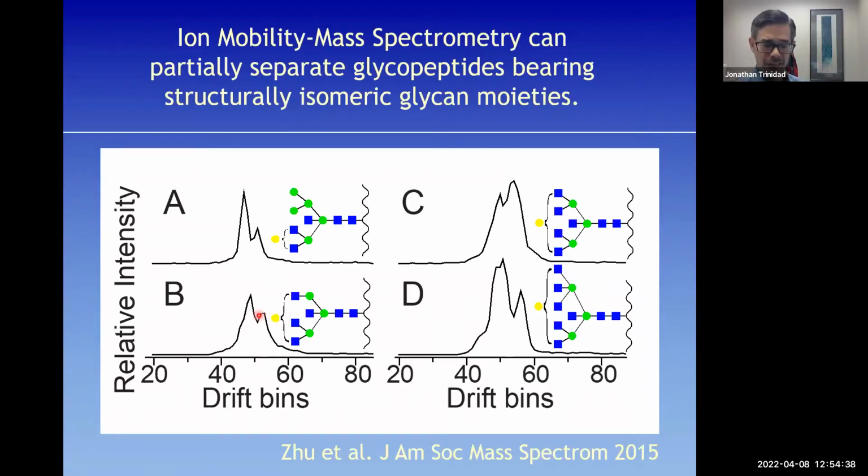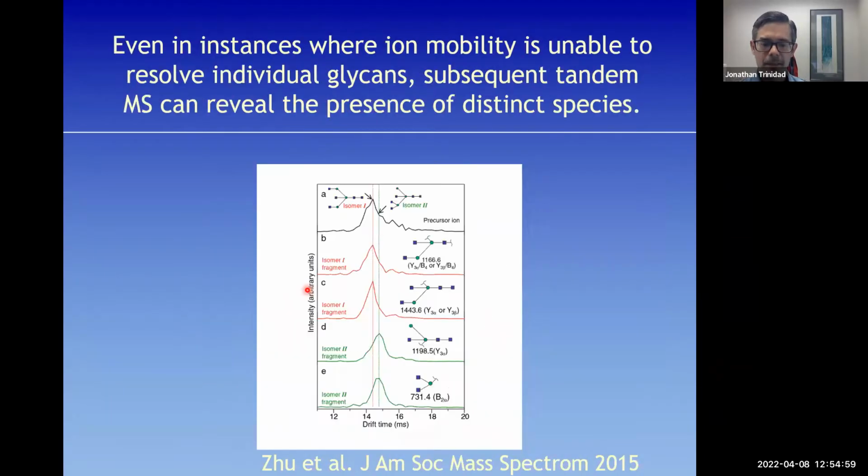But we started using ion mobility to map out the linkage, or how sialic acids, in this case in particular NeuAc, are linked to the galactose residues by fragmenting them and looking at the IMS resolution of the different pieces we see.